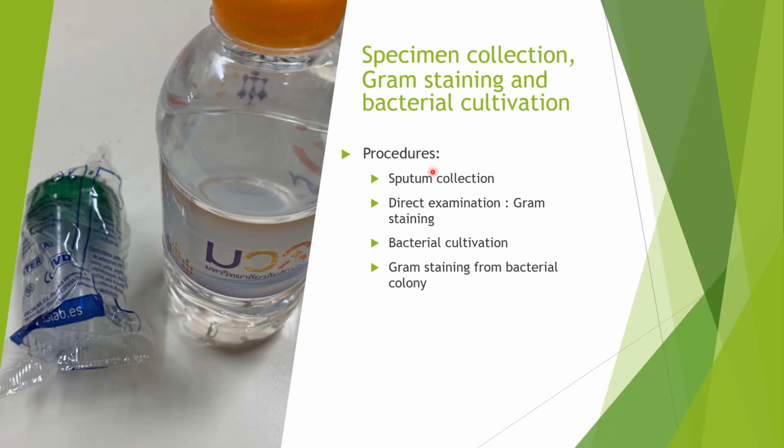For the procedures, we have first sputum collection, direct examination for gram staining, bacterial cultivation, and gram staining from bacterial colony.